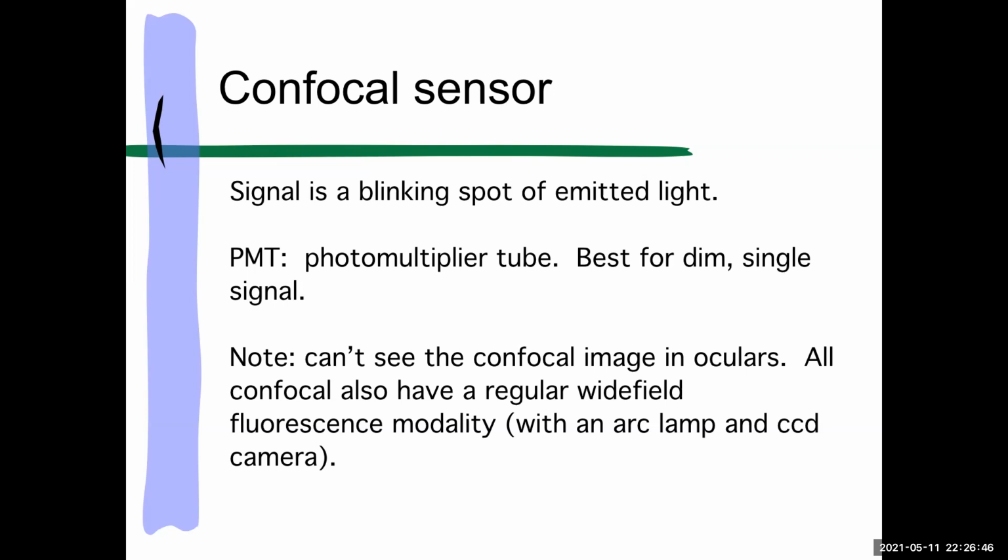So your signal is hitting the PMT, and then the PMT is reading out basically a brighter version of your signal, and the software knows where the laser was at that moment the data was collected. And so it reconstructs a digital image for you of intensity: at this location on your digital image there's this much signal, and then that much signal, and that much. And as you know, that is basically an image, and that's just one image of the Z stack.